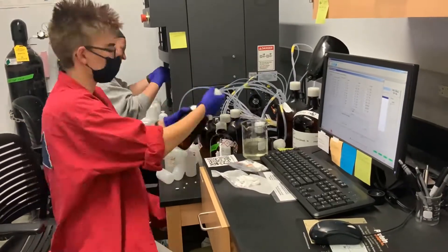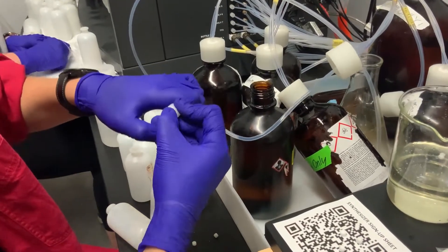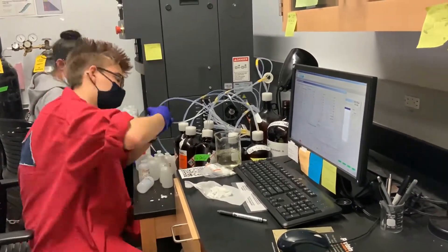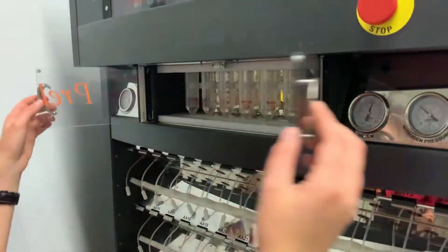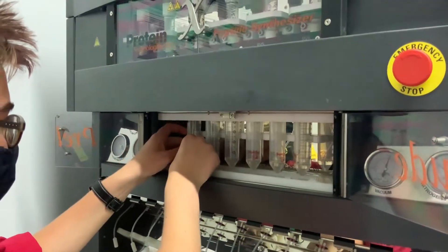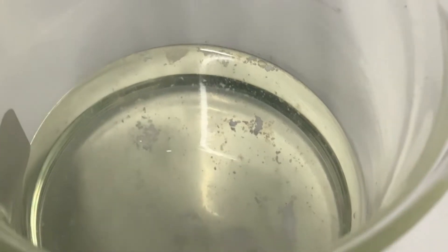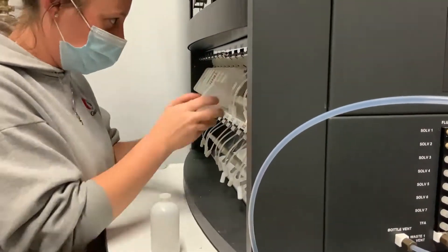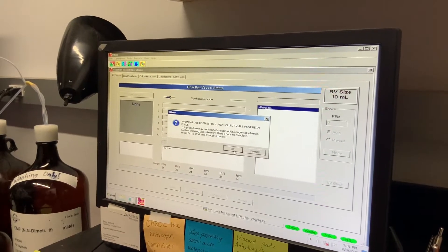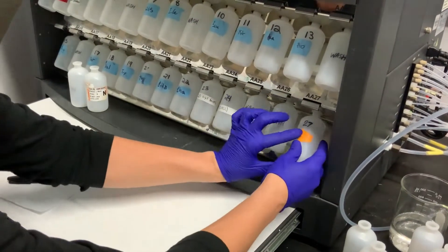Dump the waste from the reagent wash bottles and replace the filters. Carefully remove the calibration reaction vessels and dump the DCM into waste before putting them back on. If there are a lot of clumps and precipitates collected from the wash, or if the first system clean had errors because of clogs, you should run another system clean. During the second wash, the waste should appear much cleaner. Once the clean is done, dump the waste, put the original bottles back in place, and close the nitrogen tank.